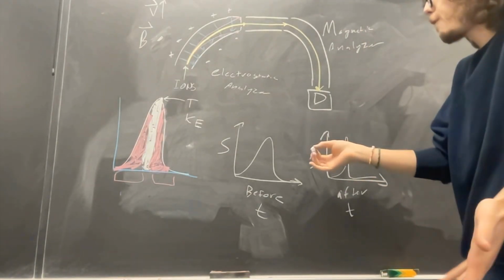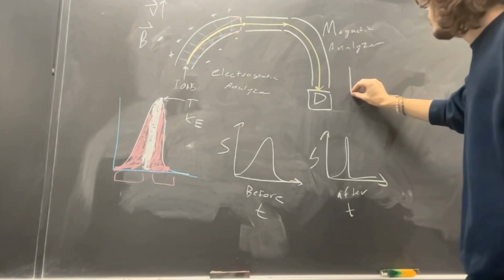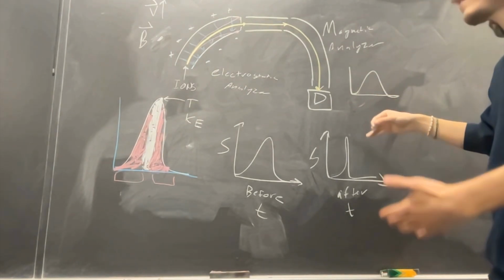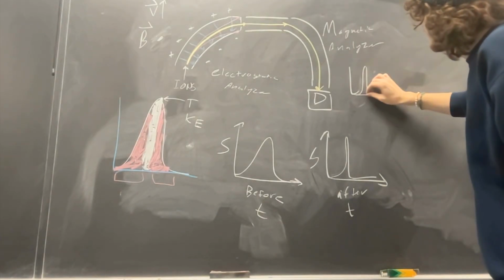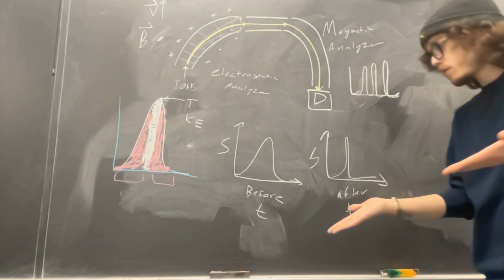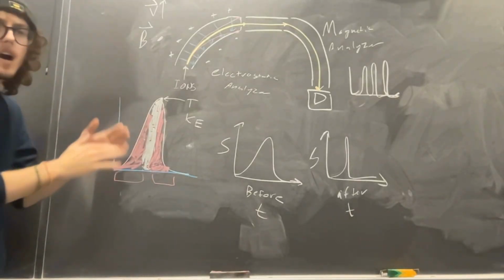This is helpful because if you have some very tricky stuff to separate, for example, you're getting this, but you know you have 3 analytes in there, you run it through a double focusing analyzer, and instead you're going to resolve those peaks and get the 3 that you want. So that's why we use it, how it works, and why there is even a problem to begin with.